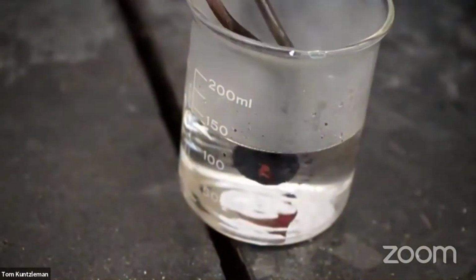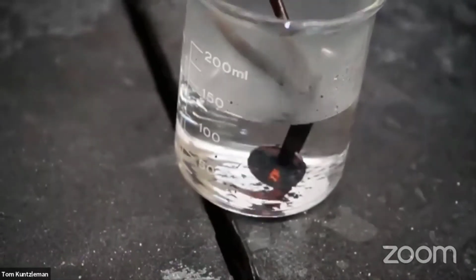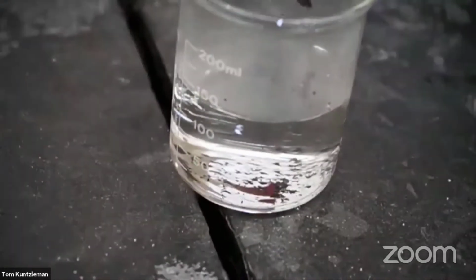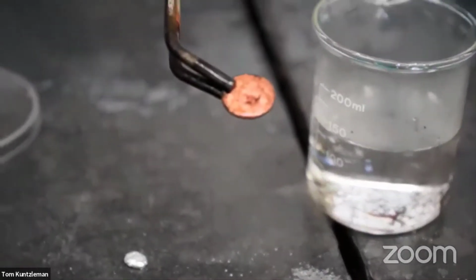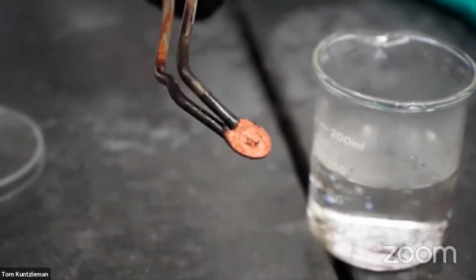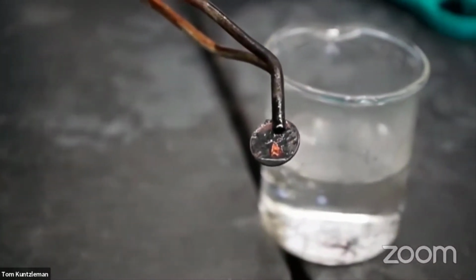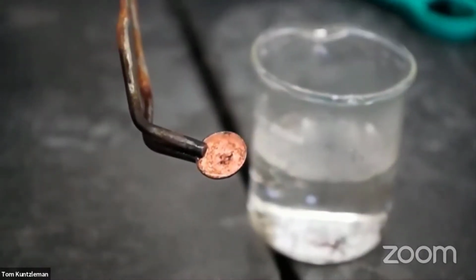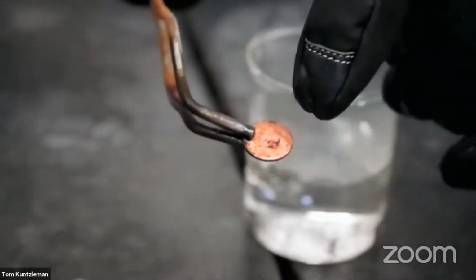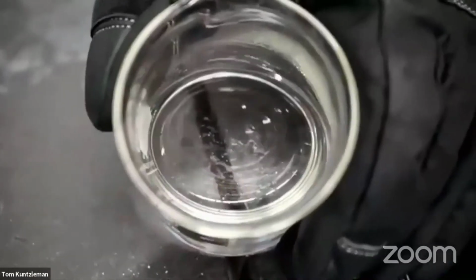Hey, look. I see flakes coming off. It looks like the copper oxide is flaking off, and I can see the bare surface of the copper metal again. Not so much on that side. Maybe that side cooled a little more. I don't know what's going on there. But sure enough, a lot of the copper oxide flaked off of this side, so I can see the copper metal. And then, of course, here in the flask, you may be able to see the flecks. Maybe not.